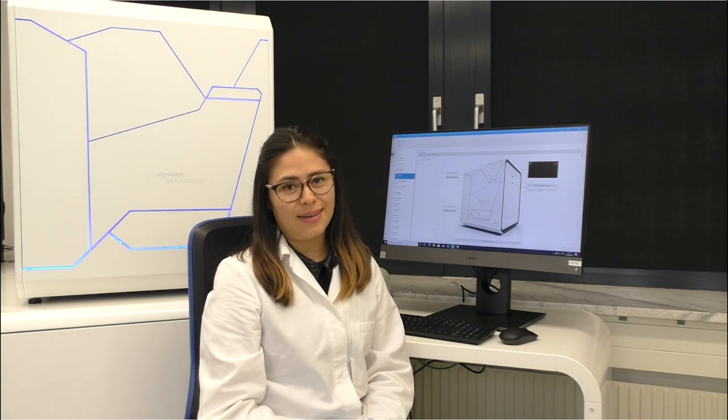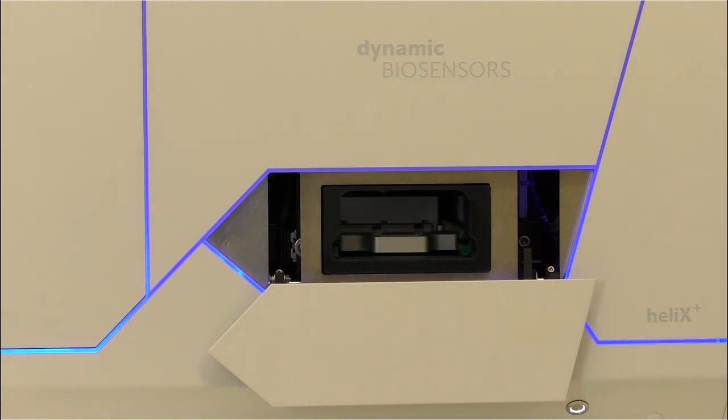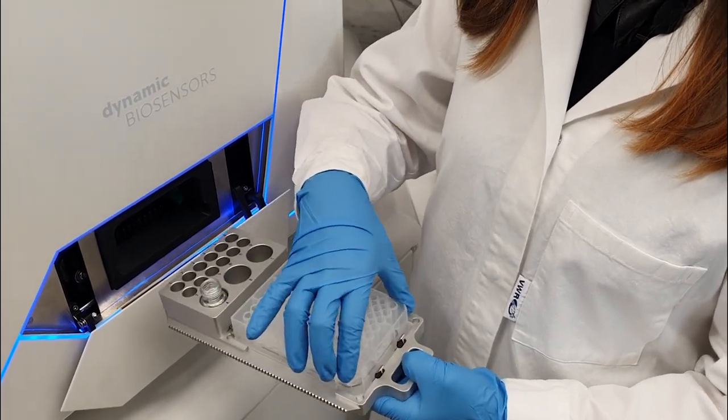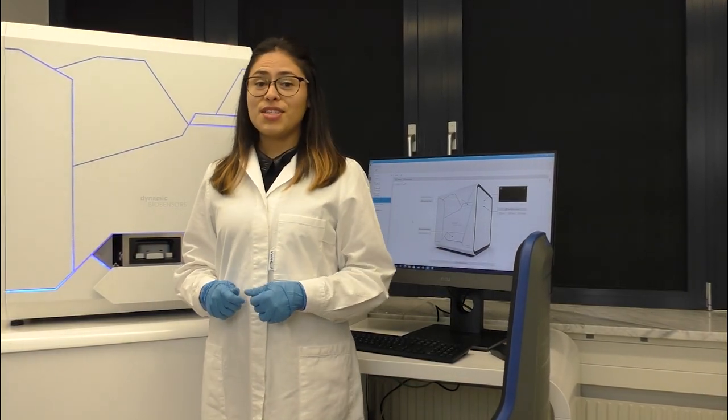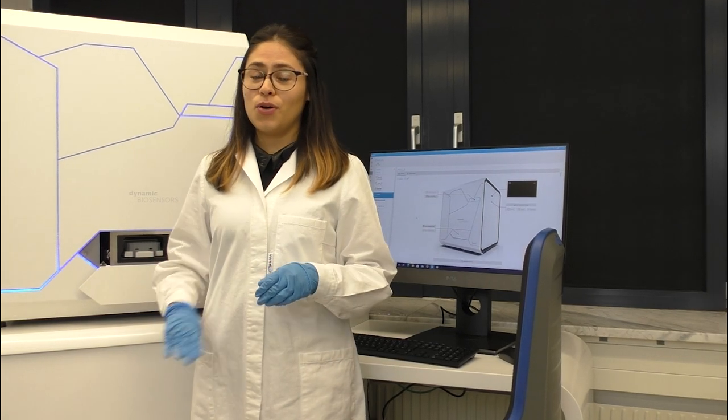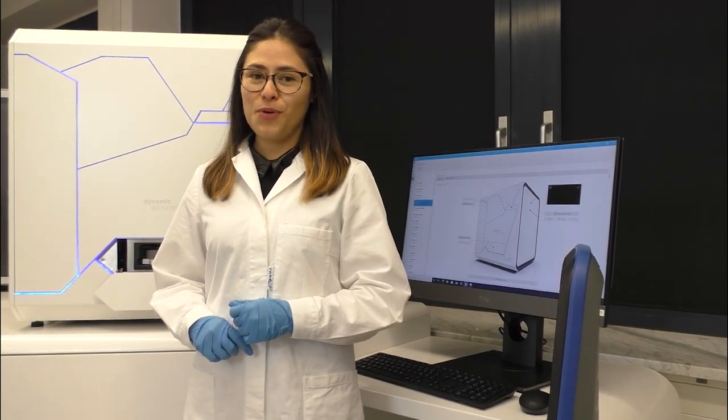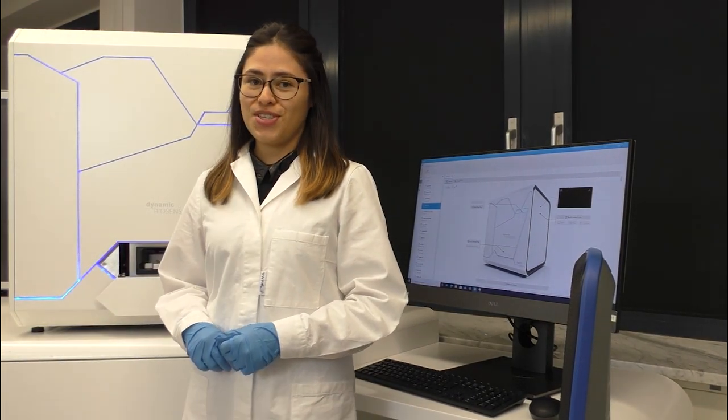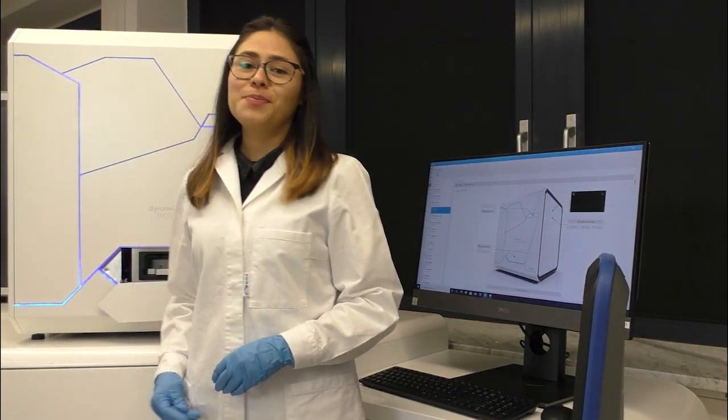Okay, we have connected to Roxy, and now we have to open the sample compartment and put in the well plate. The auto-sampler is temperature controlled and usually kept below room temperature to have samples fresh and stable. And it is always good to check if there is plenty of running buffer for the dissociation phase. We will be using PBS buffer at physiological salt concentrations. Yup, that will do.